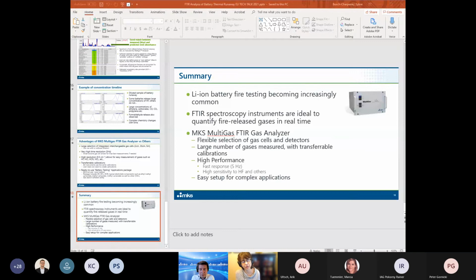But there's definitely more sampling challenges for those applications that the customer or the integrator has to address to make sure that the temperature and pressure of the gas is what we expect it to be for it to be analyzed correctly. Okay, got it. Thanks. Any further questions?